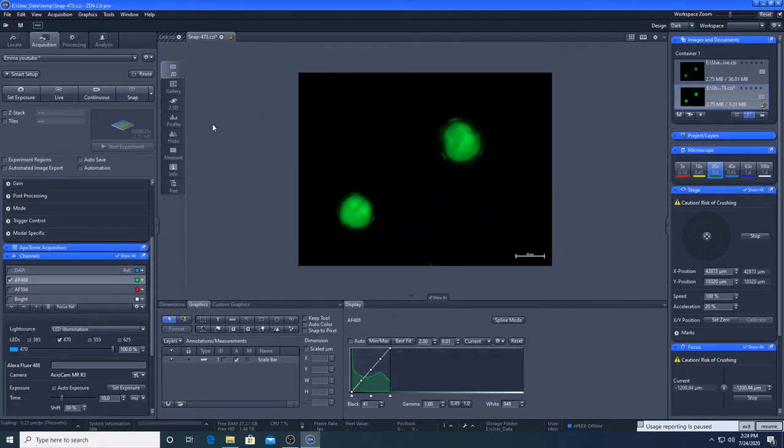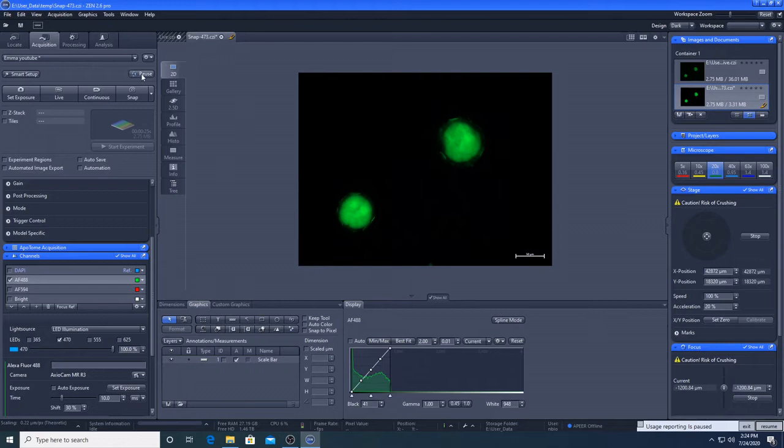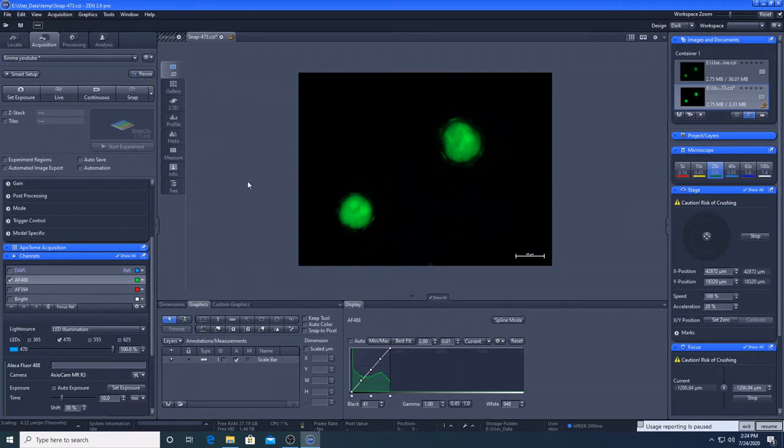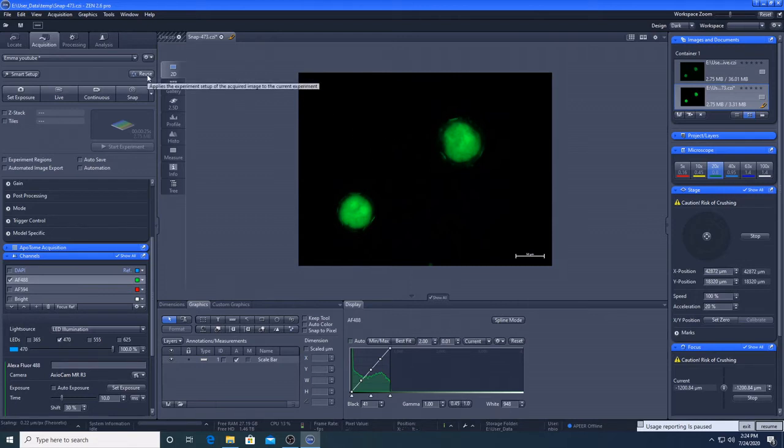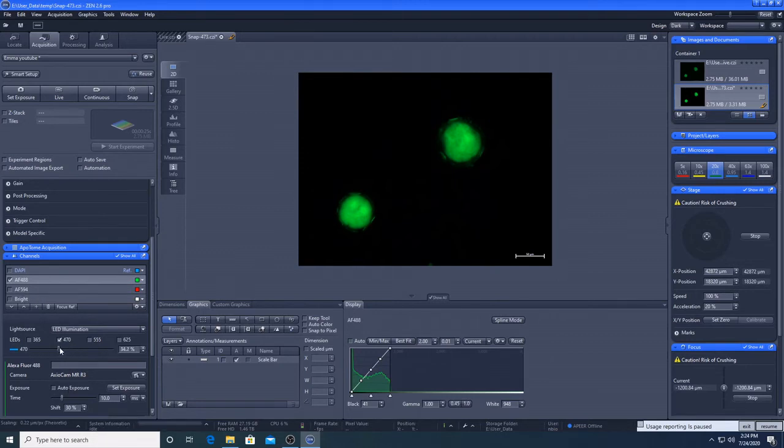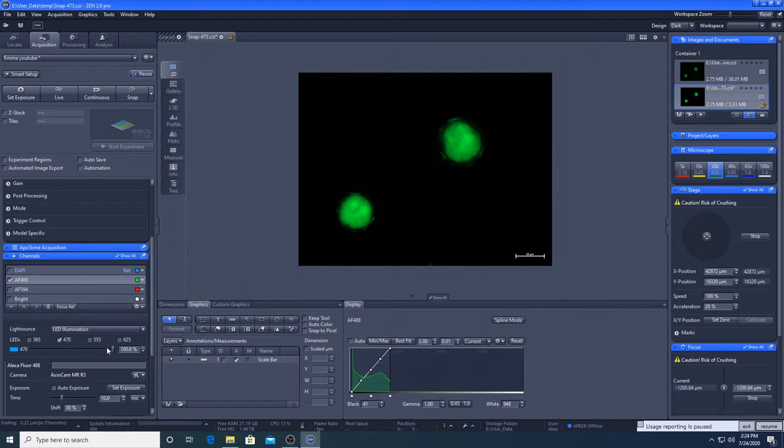If we want to reuse our settings from this snap that we've taken, we now have this button here that we can highlight. So if we make any changes and we want to go back to the settings that this image was taken with, we can hit reuse. So for example, if I change the light intensity down here, because I'm on this image, I can press reuse, and it's gone back up to 100, so that we can reuse those settings.